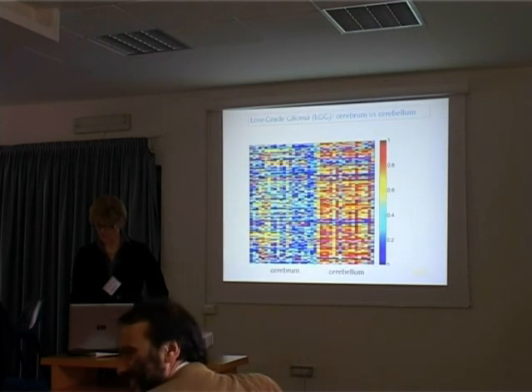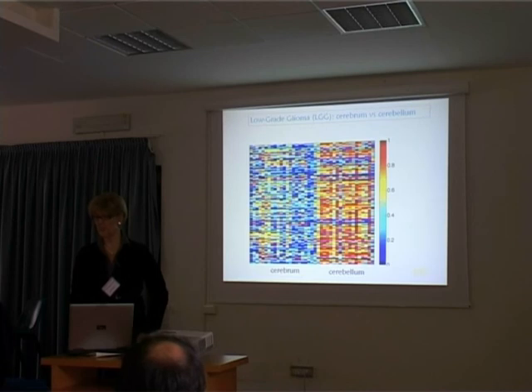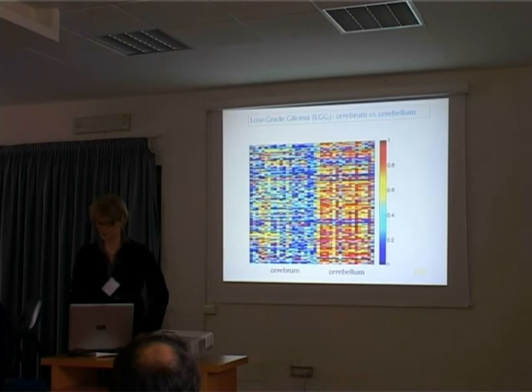The microarray technique is able to give us information on 47,000 different genes. At the end, the statistical analysis and the integration of the statistical analysis from the microarray, confirmed with quantitative PCR, will give us a lower number of genes, with which we are able to understand at least part of the genetic components of this kind of tumor.